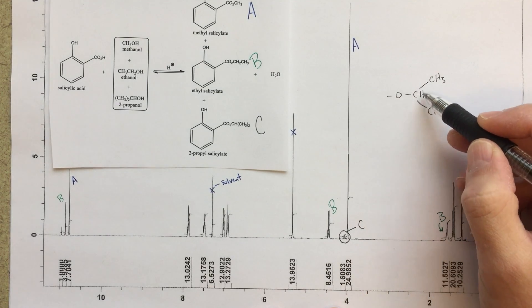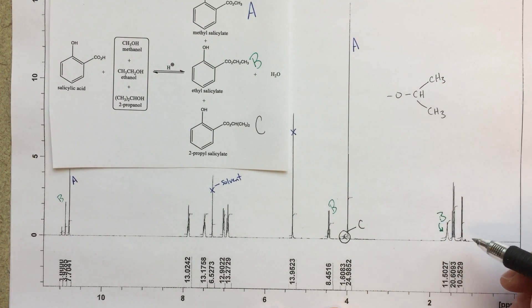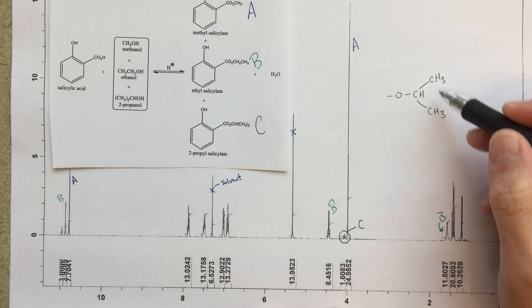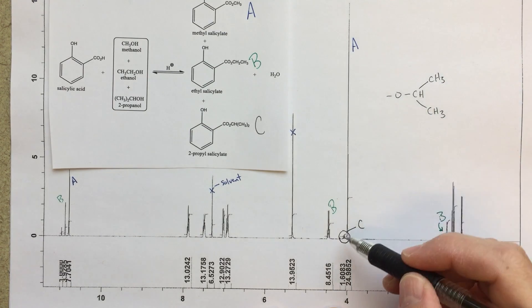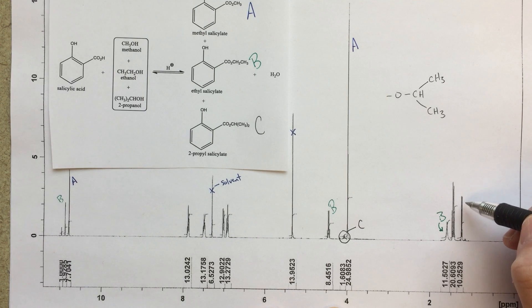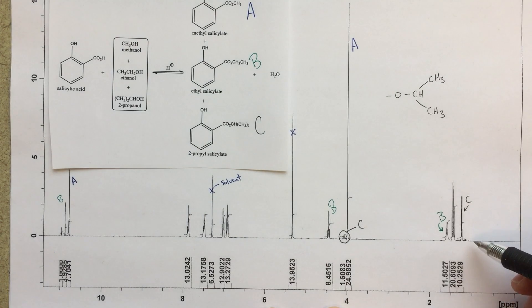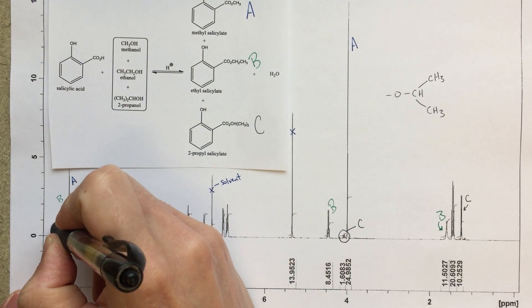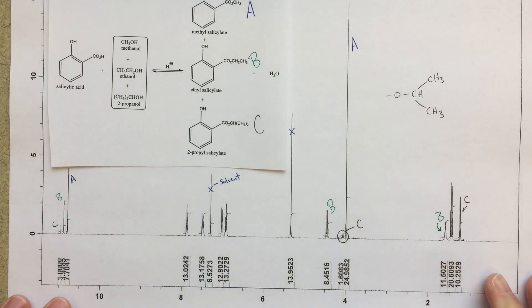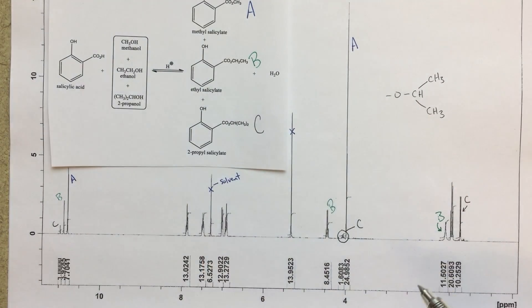And it should be split into a septet, which is what we would expect. So I see a lot of little peaks there. So we'll label that as C. So that's really going to be this CH group right there. And then over here, so roughly six times as high as this peak here, I should find my doublet. So I'm going to call this C right here. So I've got a doublet there. This is about 1.5. You multiply that by six. You get something close to 10, roughly. So we can call that C.